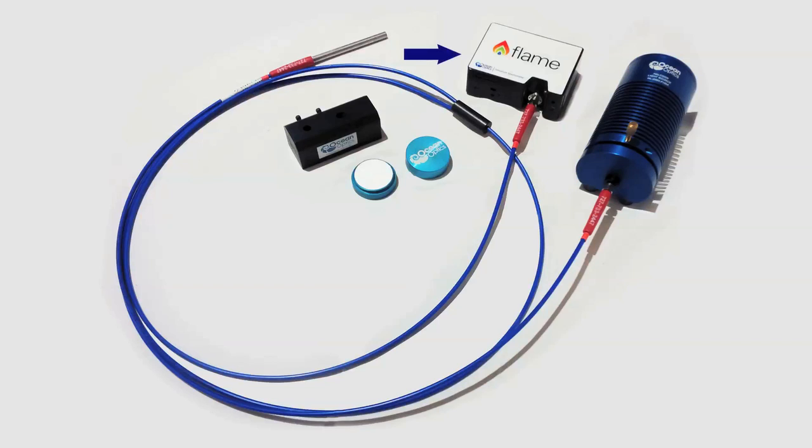Products used are the following: the Flame spectrometer, the HL2000HP FHSA light source, a high-powered tungsten halogen bulb with adjustable light output, a premium 600 micron reflectance probe for VIS NIR, the RPH1 reflectance probe holder, and the WS1 diffused reflectance standard.